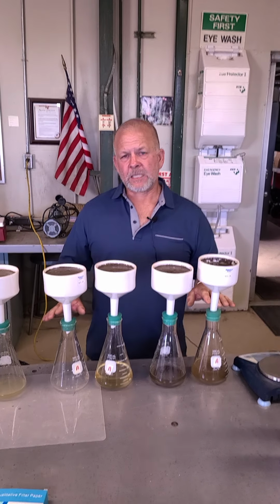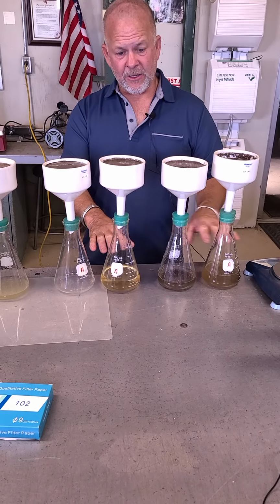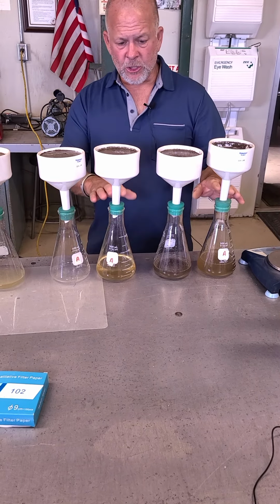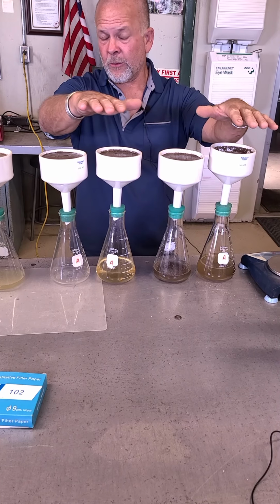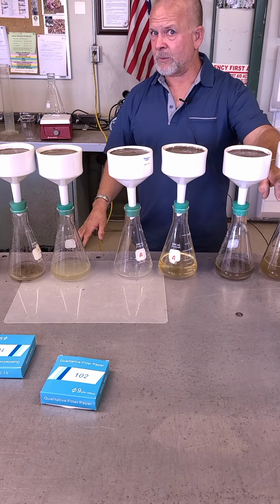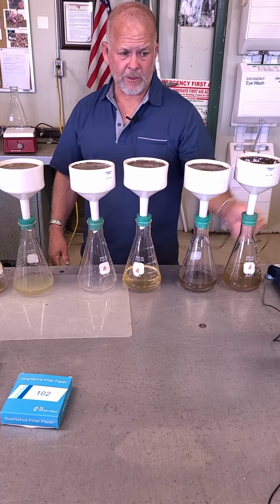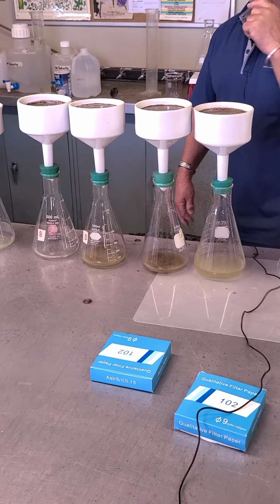So we're just about ready to stop the whole experiment here, but before I do that and pour the volumes, the leachate down here, what we call the leachate, before I pour that into different beakers, so our different volumetric flasks, so you can see the relative amounts. What I wanted to show you was I wanted to bring attention to the fact that these are still full of water, or their treatment, but yet some of them aren't even moving. You can see here, number one, that would be the deionized water. I don't really see much happening. As a matter of fact, the only one I really see in sample one moving is the third treatment. That third treatment's the only one that's actually doing anything. The third treatment, again, is the sodic one.